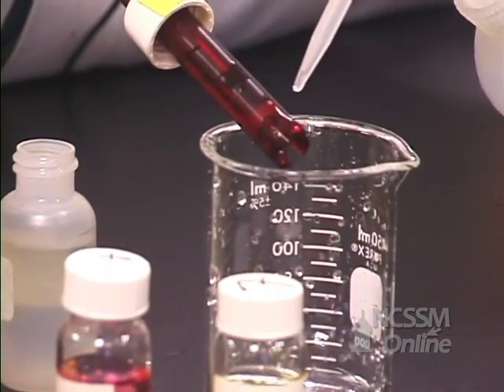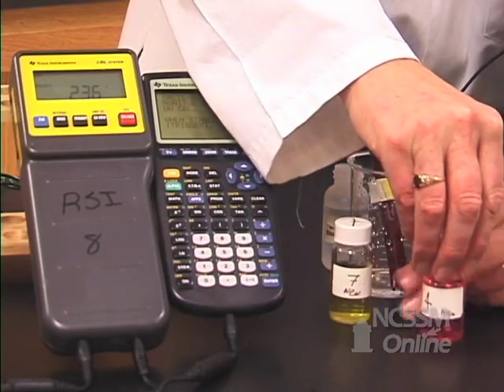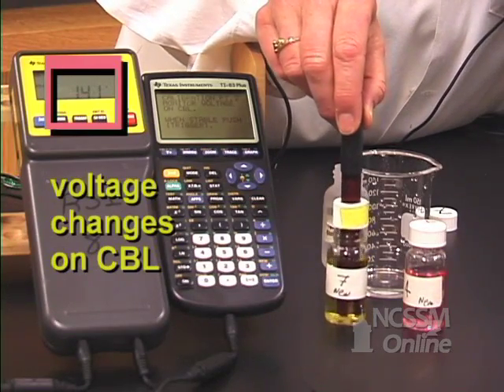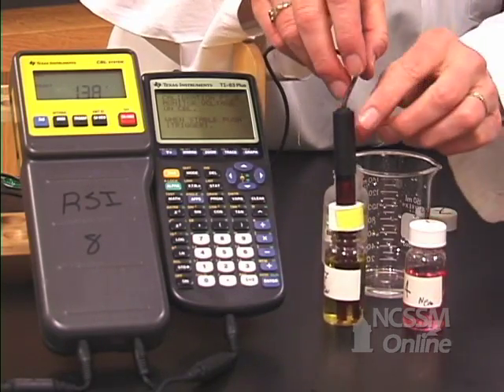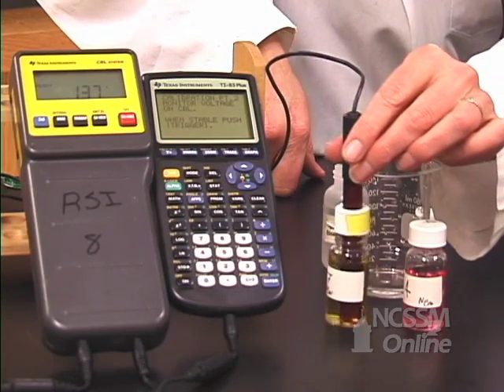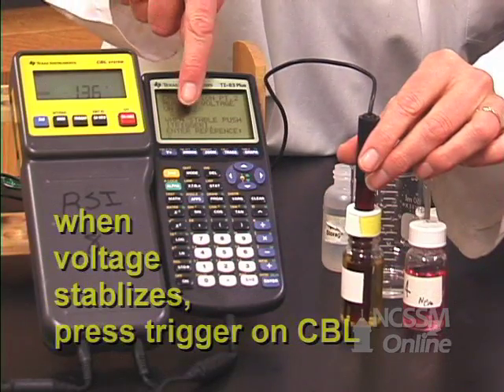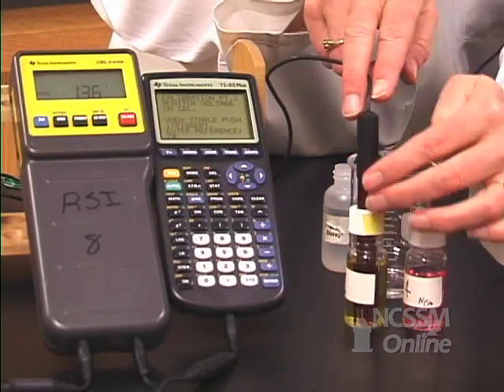Now rinse the probe again and place it in a pH 7 buffer. Watch what happens to the voltage — it starts to drop. Now it's holding steady. When it holds steady, press trigger. When you press trigger, it says 'Enter your reference number.' We're using a pH of 7, so type in 7 and press enter.